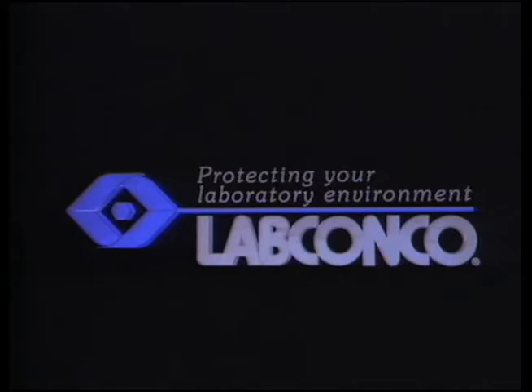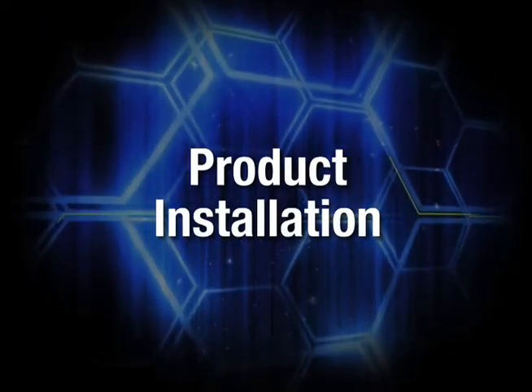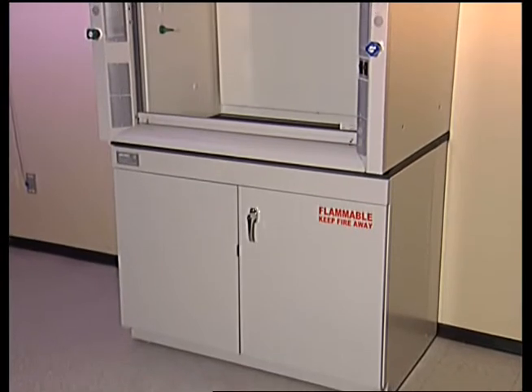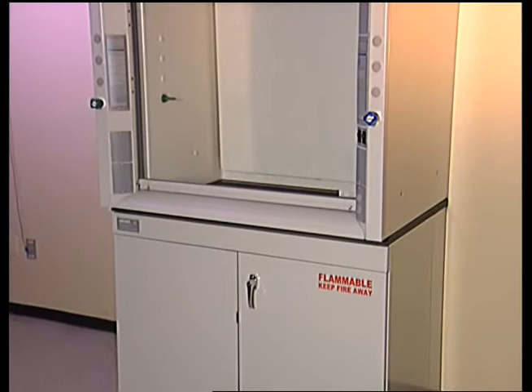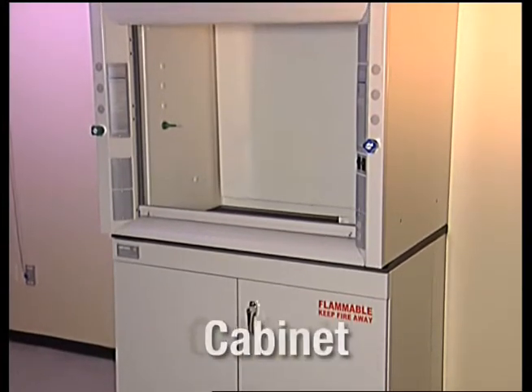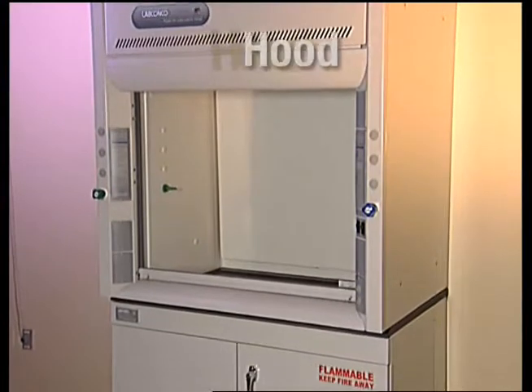LabConco — manufacturing quality laboratory equipment since 1925. Your LabConco products have been shipped to you assembled and ready for connection to services and ductwork. This video covers installation of the Protector Solvent Storage Cabinet with molded epoxy work surface and the Protector Premier Laboratory hood.